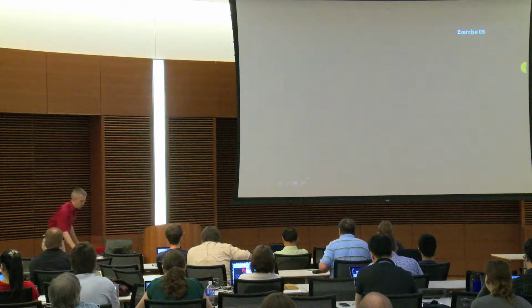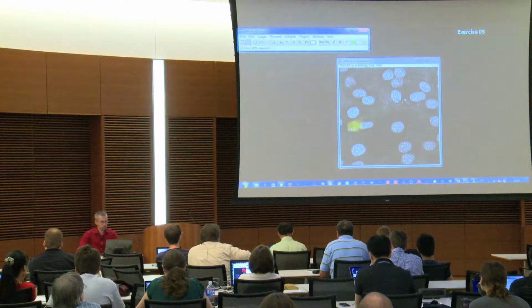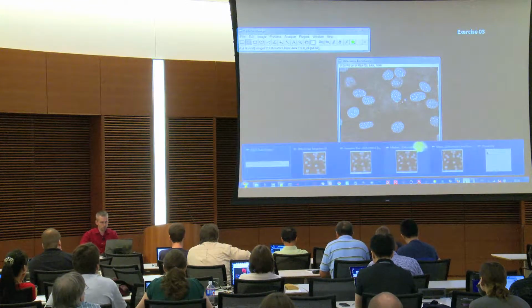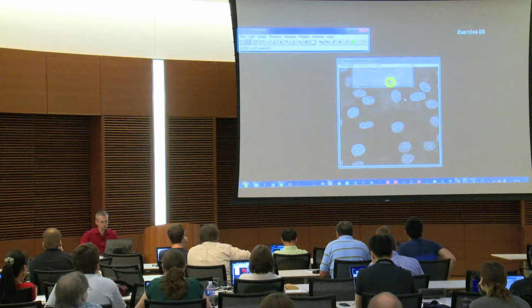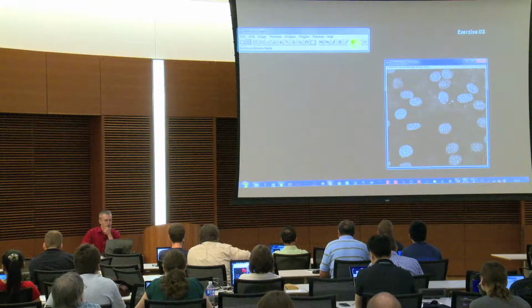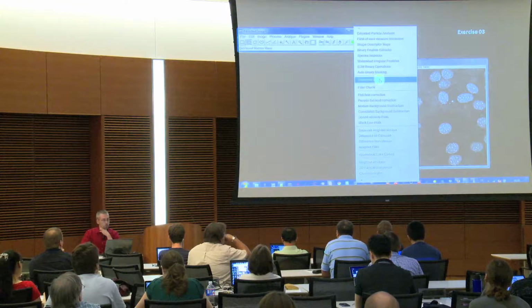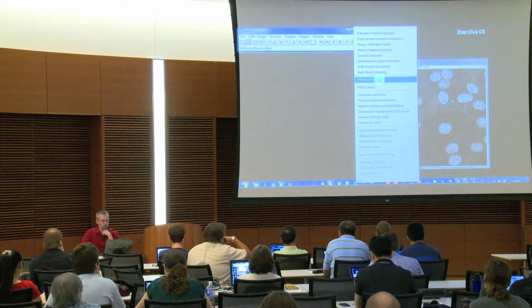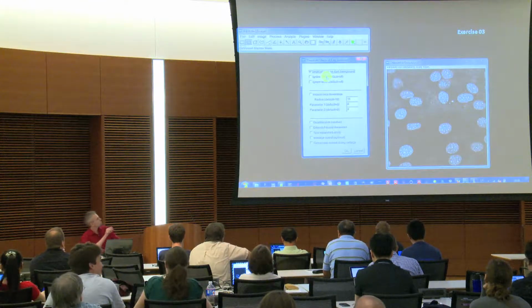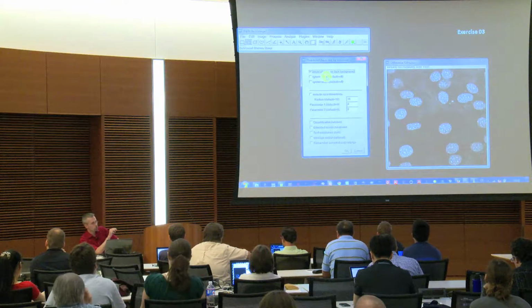So this is what we can test now here. We use the same image we had before from exercise 3, so this one. Let me close the other one. Okay. So, and then if you go to the green cube and choose the threshold check, then you see here exactly the same possibilities or options. You have bright objects on a dark background. That is what we have. So we would choose that one.